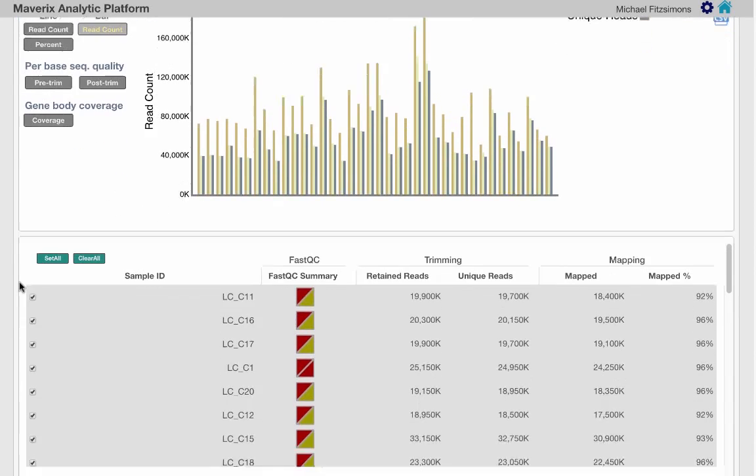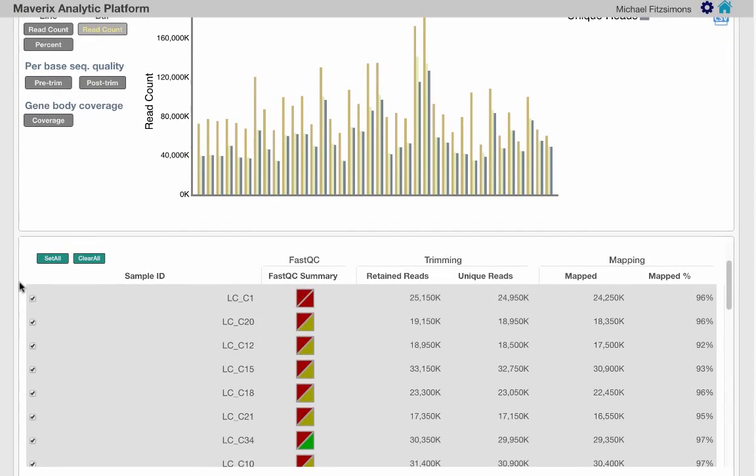The table at the bottom includes additional information beyond what is plotted on the top. All data shown in the table can be easily exported.